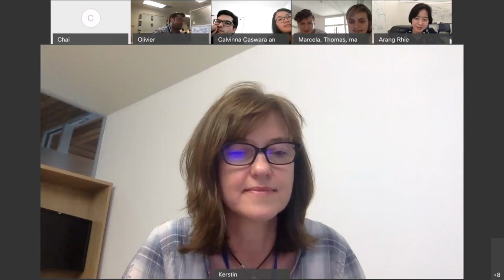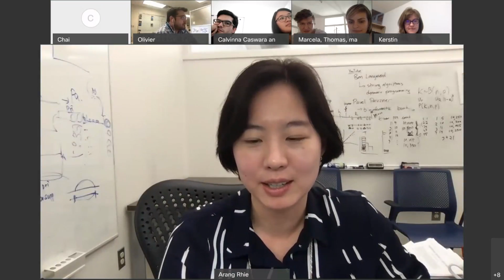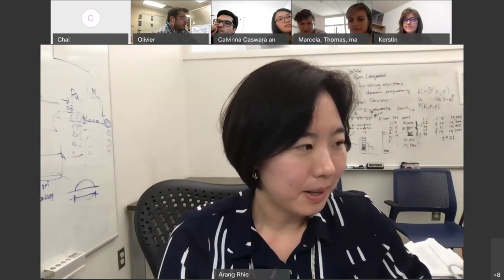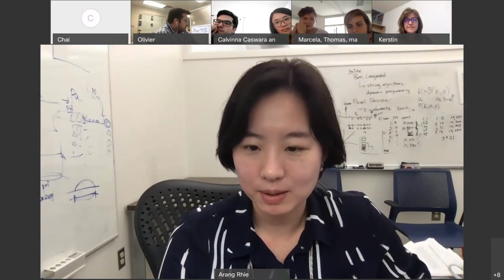It would be good to have an app that automatically runs the contamination checking. In the plan we have Purge Dups, which is going to update our whole assembly pipeline.